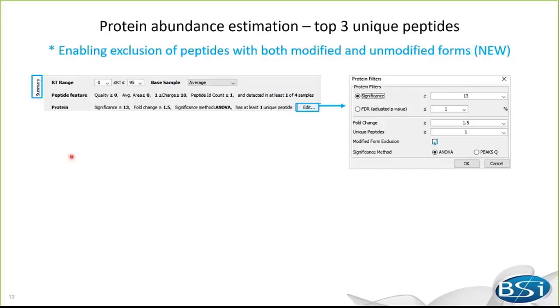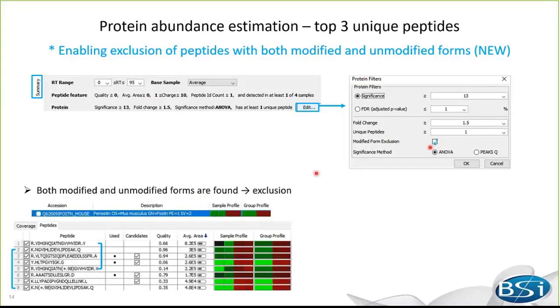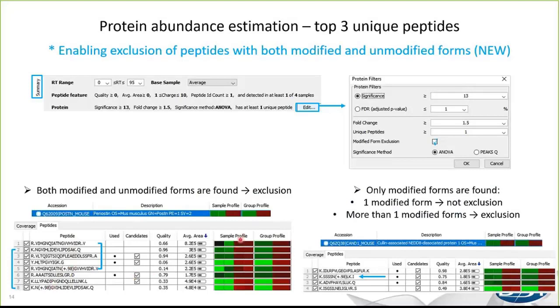PEAKS first calculates a protein's supporting peptide average across all samples, and selects the top three unique peptides for protein abundance estimation. The summed area of these three peptides is used to represent the protein amount in that sample. And the protein group area is the sum of the peptide group area. In addition, when the sequence of a peptide is a sub-sequence of another peptide in the top three list, then the peptide with lower average area will not be used for protein quantification. This is because it is likely that redundant quantity information are provided from these two peptides.